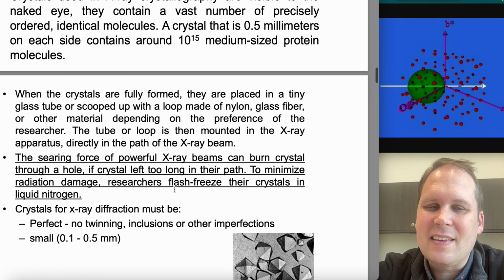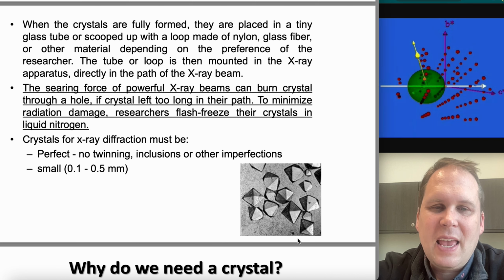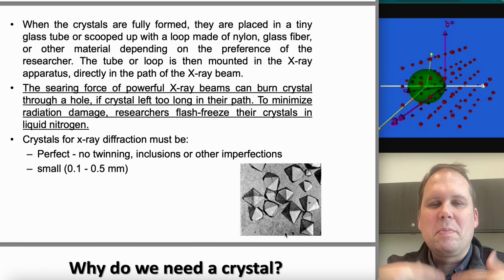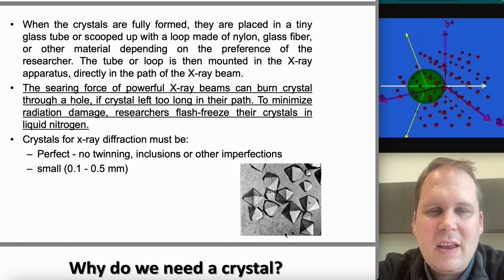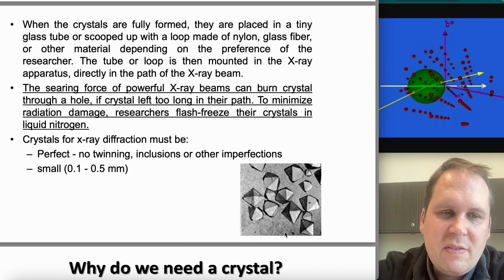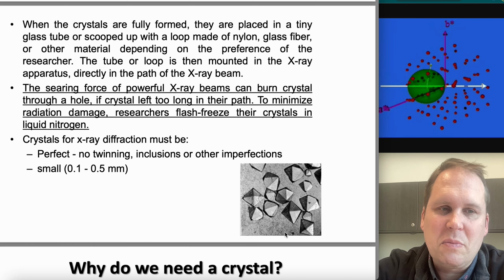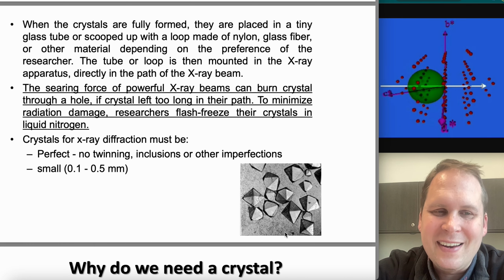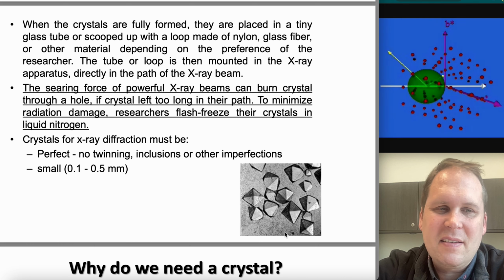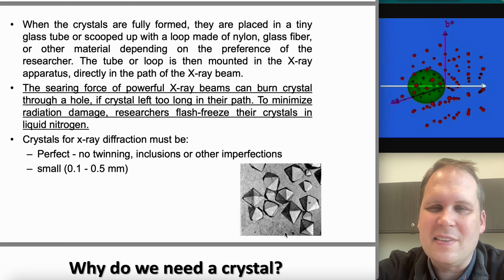Protein crystals are like little chunks. They look like little jewels. And the crystal shape, you'll sometimes have multiple crystal shapes in the same preparation, which can sometimes reflect different organization of the proteins. Because just like you can stack cannonballs in different ways and still make a little cannonball tower, you can do the same thing with crystals. Actually, it's a lot more complex. It's more like the way you can stack Legos in different ways.